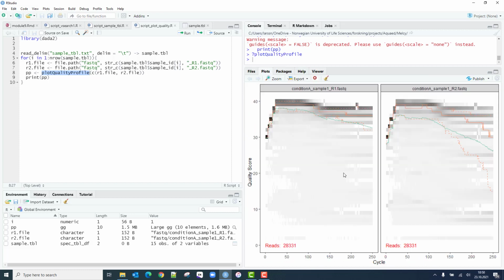So if we go back here, where were they? Yeah, here we have one dashed line and the second one here. So the majority of the reads are in between here, right? And as always, we see that the R2 reads are poorer. R2 reads are always of poorer quality than R1 reads. It drops faster towards the end here. But they are also fairly good for a long time. And if you draw a limit at 20, they are actually quite good. But these are even better, right?